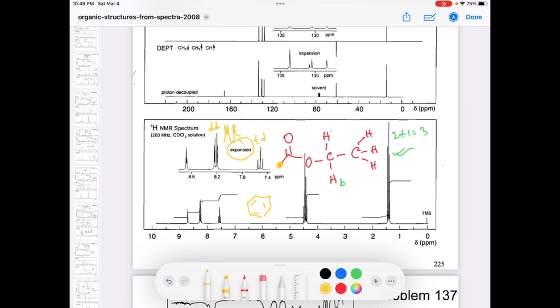So why, how? There are not 2 doublets, so that's why this benzene ring is not 1,4 disubstituted. I'm saying again, it is not 1,4 disubstituted. So this benzene ring should have a little bit different substitution position. If you take this benzene ring here, now to make a proton a singlet, which is actually like a triplet, I will explain why it is a triplet, but for now assume that it is a singlet, a doublet and a triplet. For now just think that.